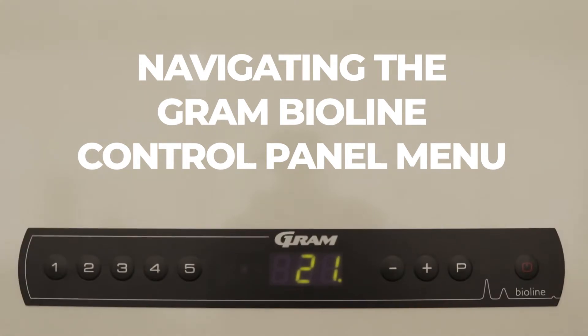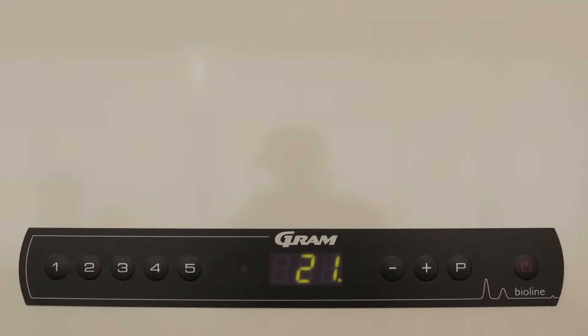Welcome to an all-round introduction to navigating the menu on your Gram Bi-Align control panel. To begin, it is important to know that the P, Plus, Minus, and Power buttons are used to navigate and select within the setup menu.